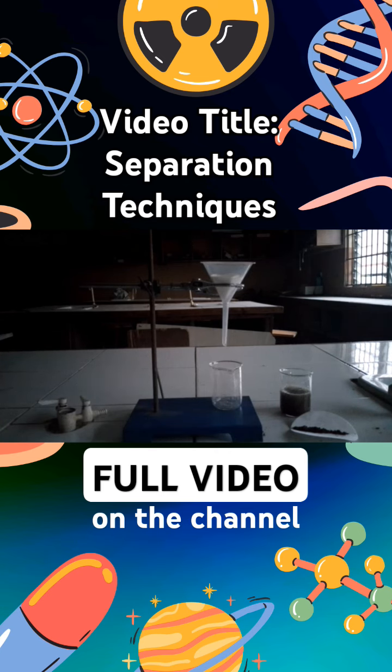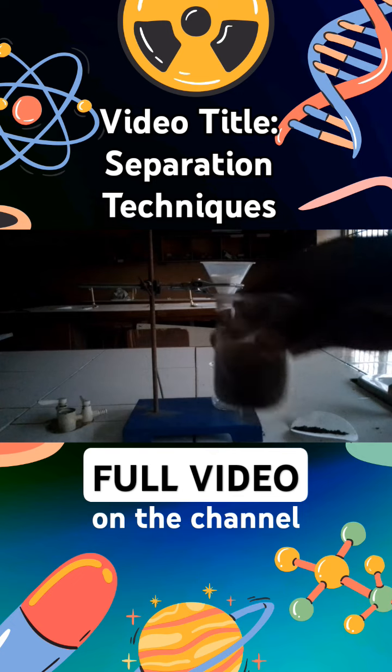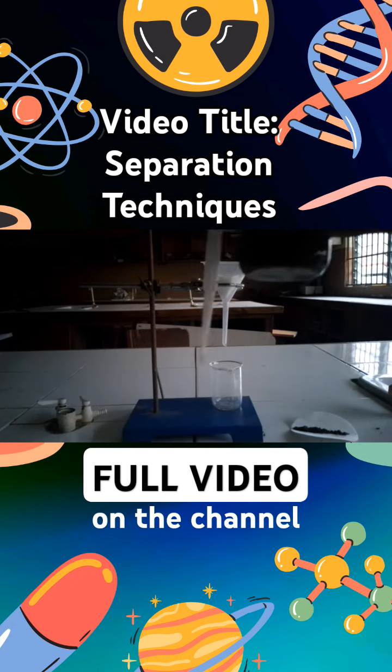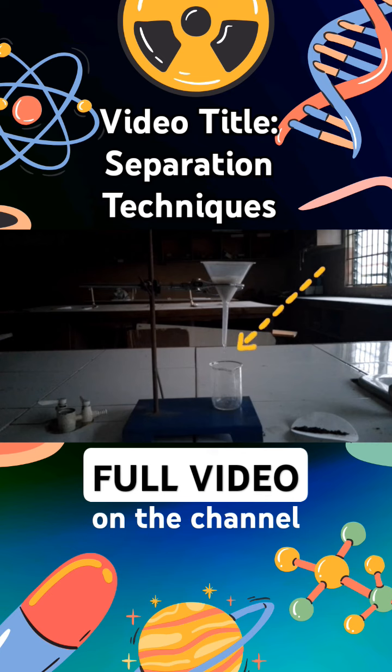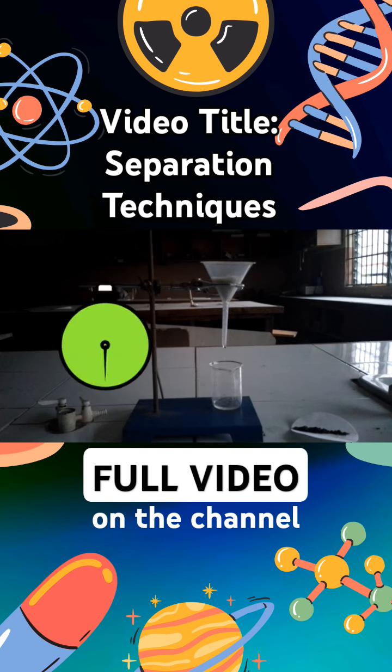So let's do that. We are just going to pour in this mixture of sand and water. We are going to pour that into this funnel with filter paper. I'm going to be careful with it. As you can see, water droplets, and that water droplet is clean. It is not coming out with the sand. So I can add more, just a little bit more. Let's wait for the process to occur. Now I will speed up the video.